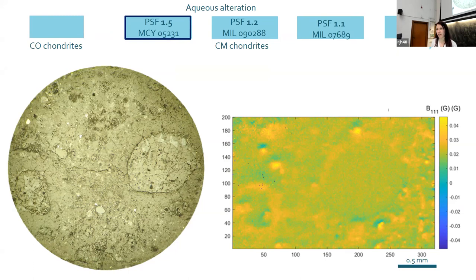Now, with the magnetite in this, A, it's very rare, and B, it's not actually magnetized as far as I've seen. I could not find a good picture to show it, which is a little bit upsetting, but that's because I've been taking the optical images on my phone due to logistical issues last time.